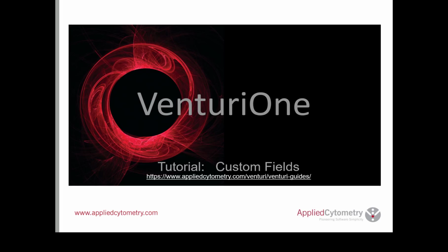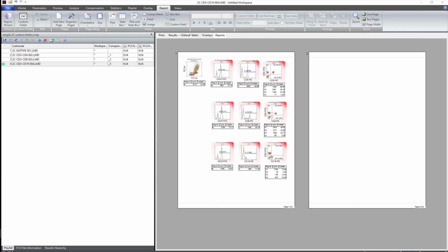Custom Fields tutorial. We have already seen how we can add plots and statistic boxes onto a report. In addition to this, VenturiOne allows us to create custom fields which can be added onto a report as well. The custom field can either be individual results or a calculation based on more than one result, or they can be rules, which is interpretive text, which is based on an outcome of either a field or a calculation.